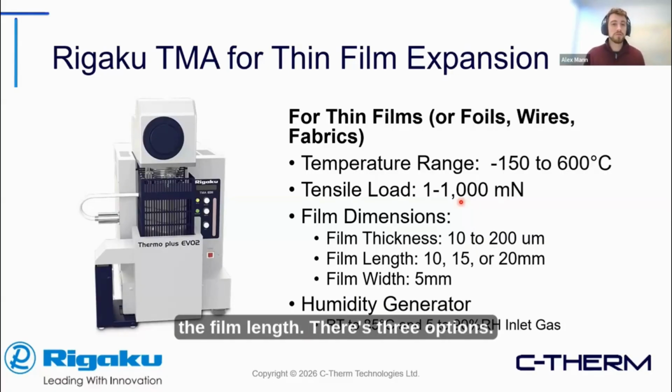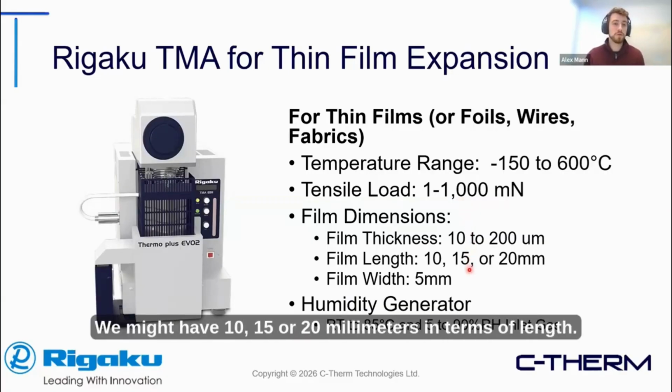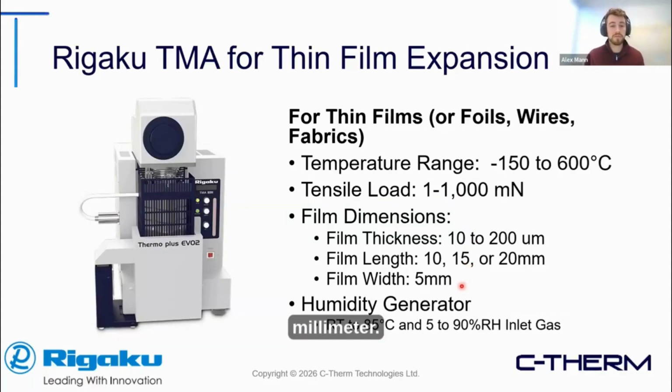For the film length, there are three options. We can have 10, 15, or 20 millimeters in length, and then our width is fixed at 5 millimeters.